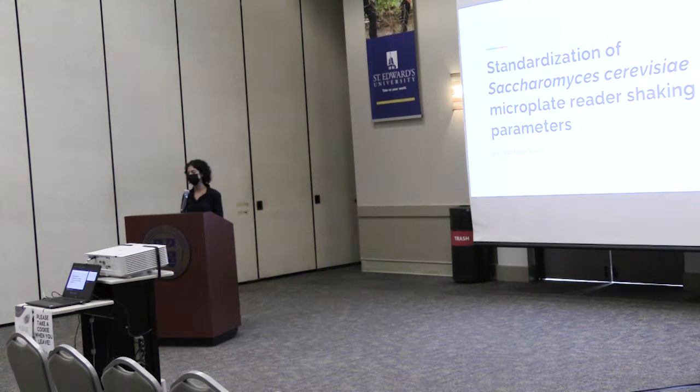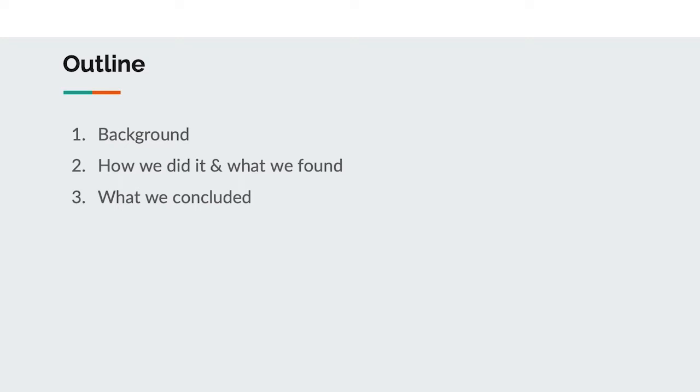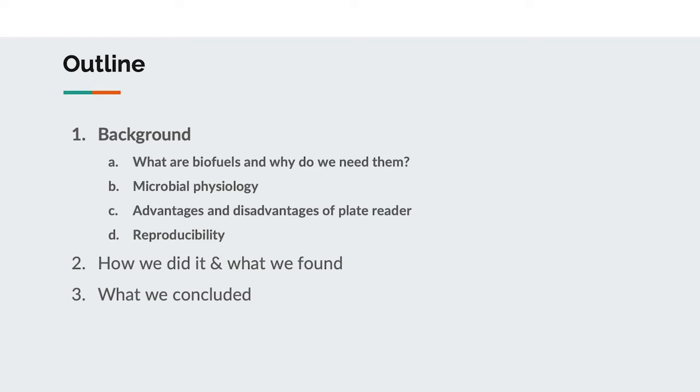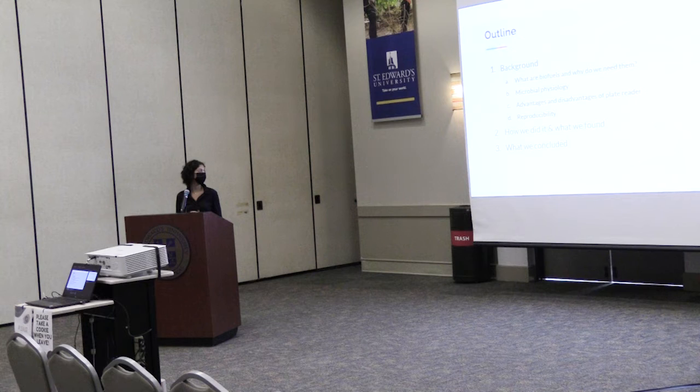Microplate reader shaking parameters. I'm going to tell you some of our background, then the experiment we did, the results we found, and how we concluded that. For the background, we're going to talk about biofuels, microbial physiology, advantages and disadvantages of the microplate reader, and reproducibility.